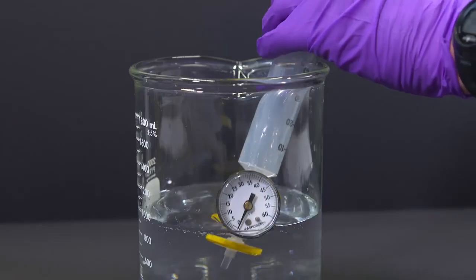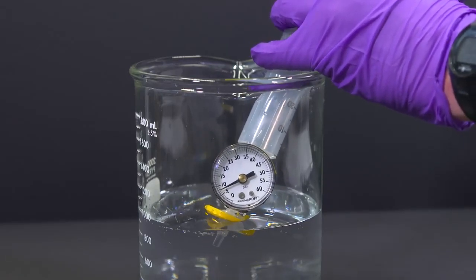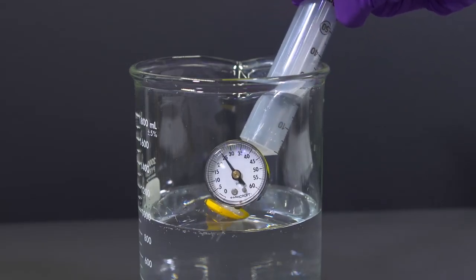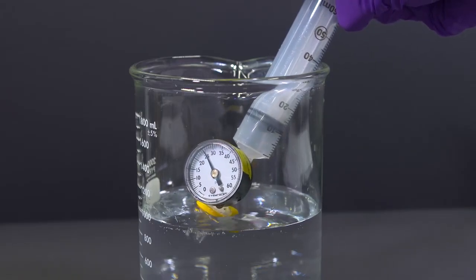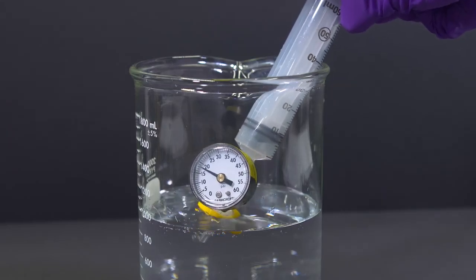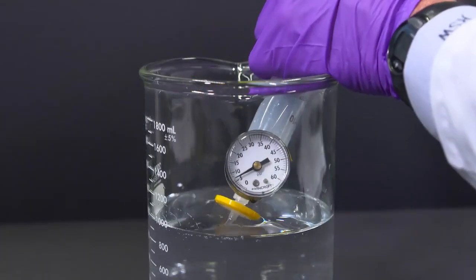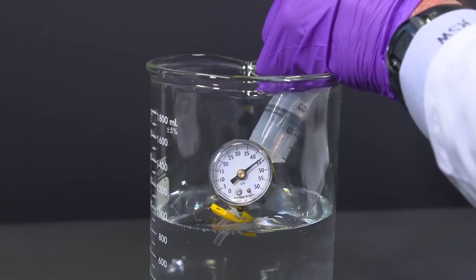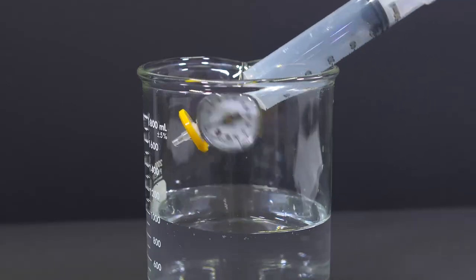The blue filter has a 0.8 micron rated membrane in it. When I use a 0.45 micron membrane, I have to push a lot harder to reach the bubble point. With a 0.22 micron rated membrane, the capillary forces are so strong I can't apply enough force with this syringe, even when I push as hard as I can.